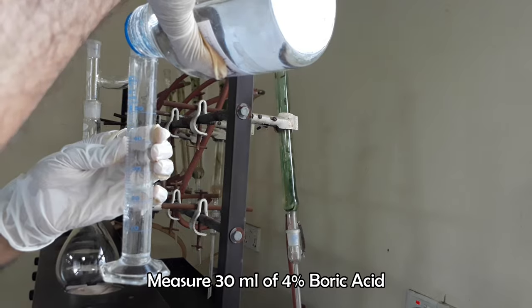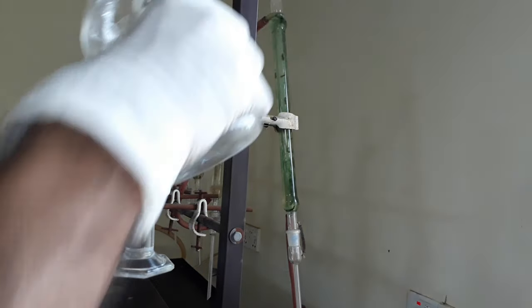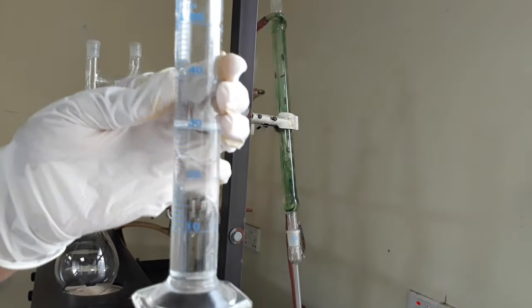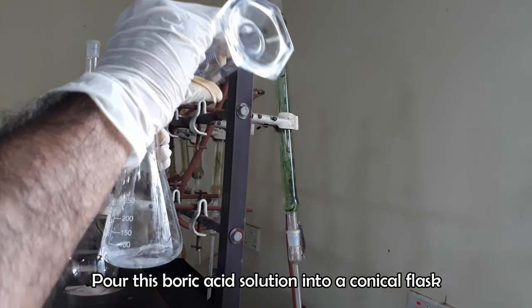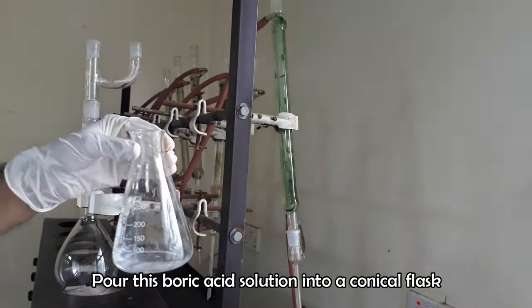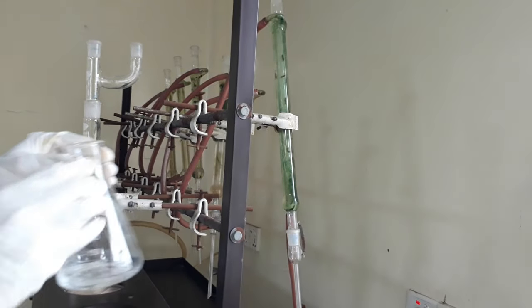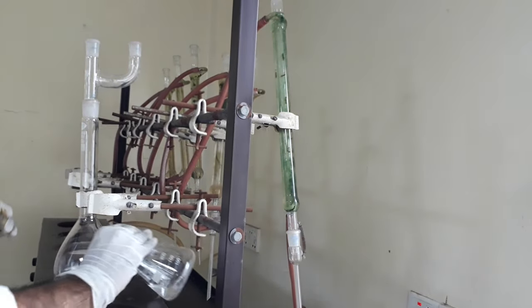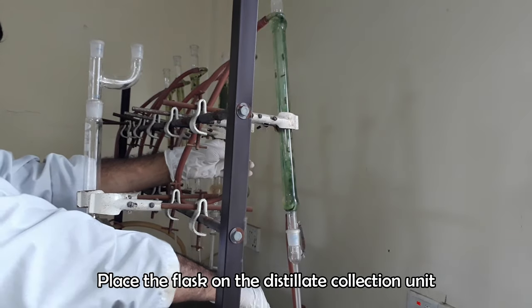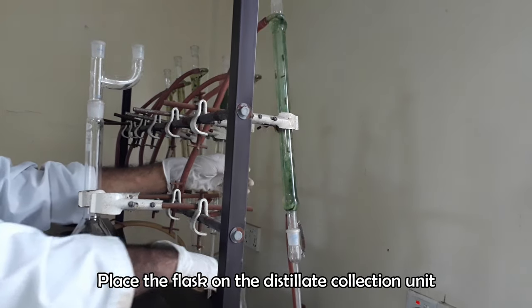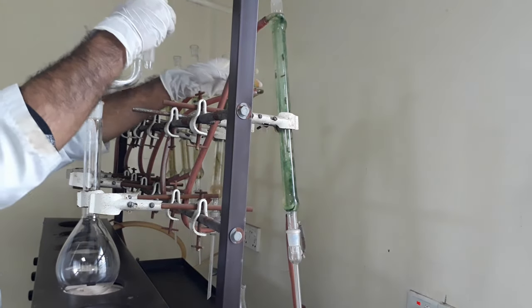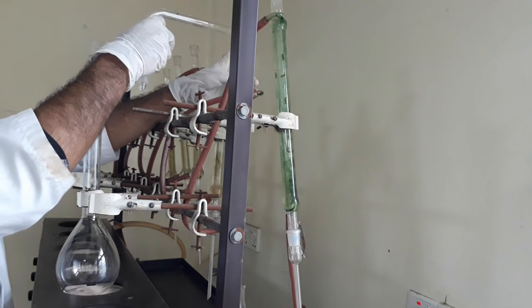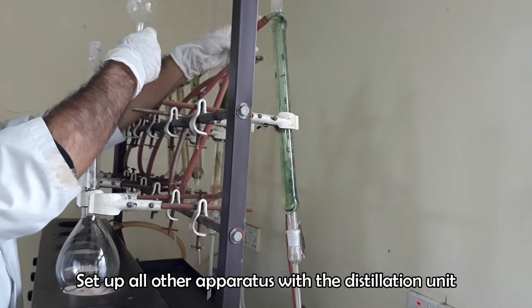Measure 30 ml of 4% boric acid and take into a conical flask. Place this conical flask in the distillation unit where the distillate will be collected. The distillate will be collected in the same flask that already contains 30 ml of 4% boric acid solution. Arrange and set all other parts of distillation unit.